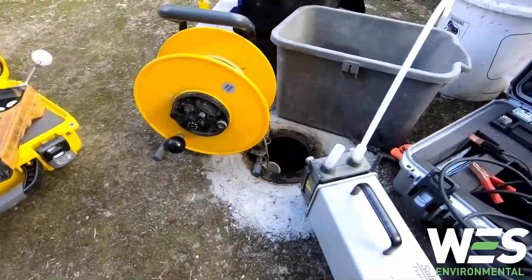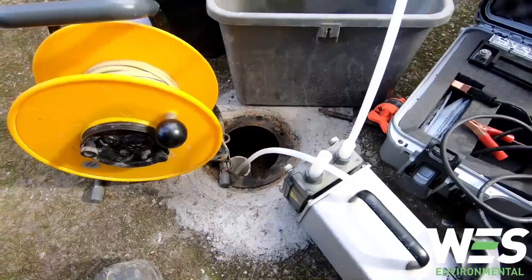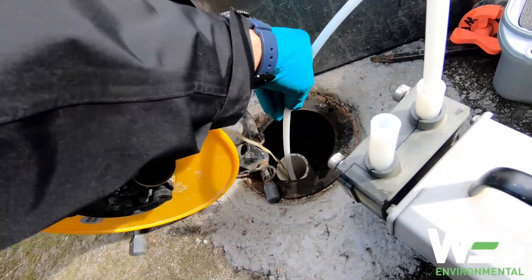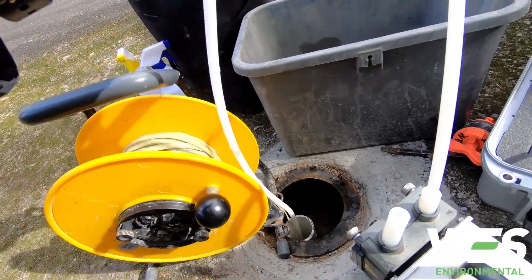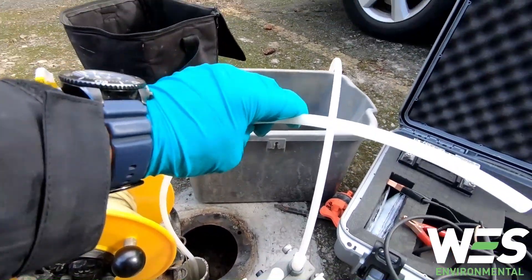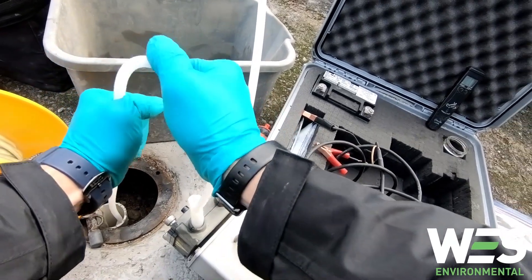That way if the well has any spacing between the riser and screen, this should just slip by it. So this tubing is all the way to the bottom. From here I want to pull it up about a foot to two feet off the bottom so that it's not in any of the silt or sand that's collected at the bottom of the well. And then because this is high-density, I'm gonna shake it a bit so that it goes nicely into the silicone tubing and stays about two feet off the bottom.